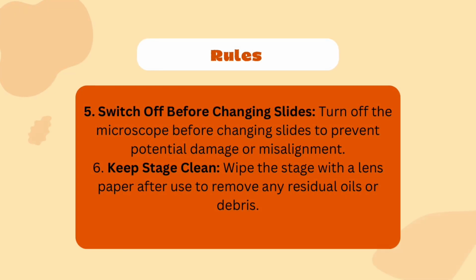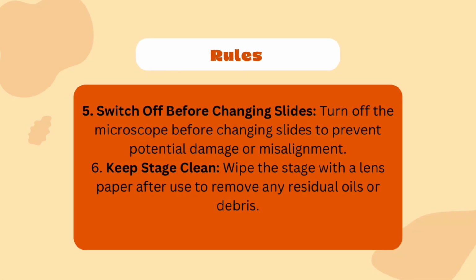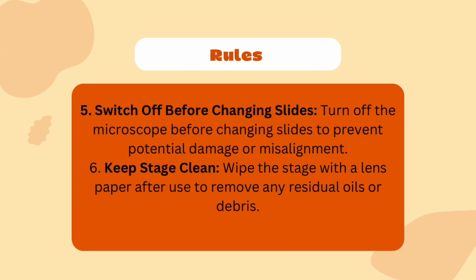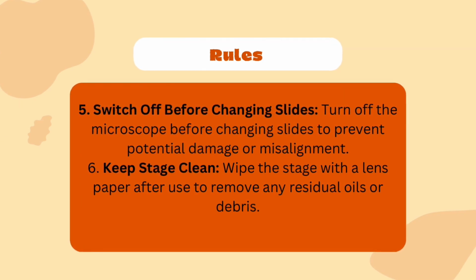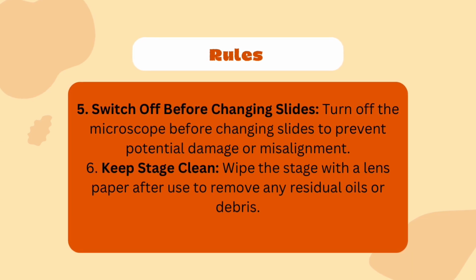Next, switch off before changing slides. Turn off the microscope before changing slides to prevent potential damage or misalignment. The sixth one, keep stage clean. Wipe the stage with a lens paper after use to remove any residual oils or debris.